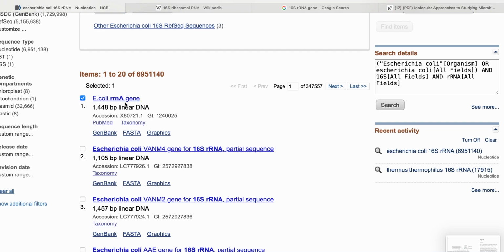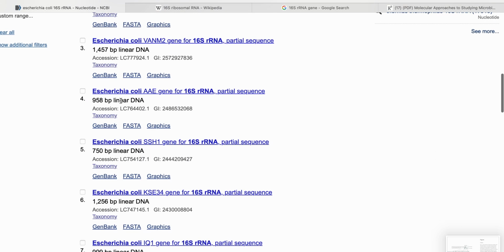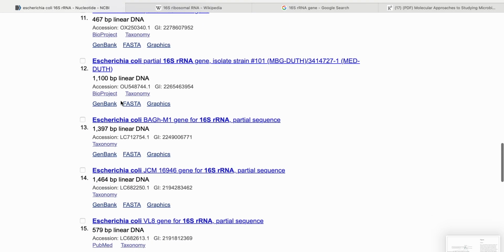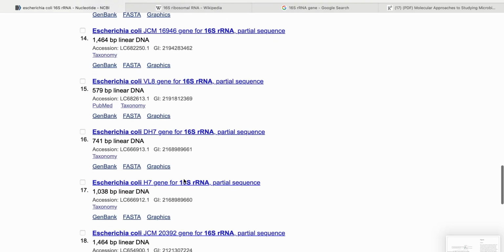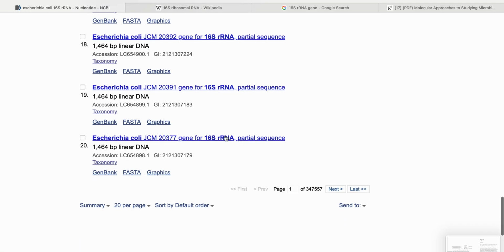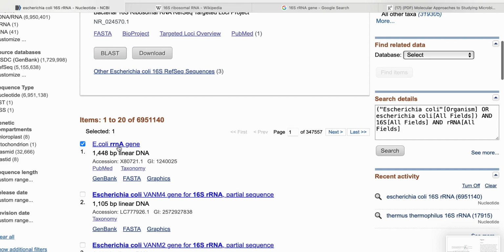And it's saying, although this doesn't, well, we don't know what that really means. Let's look for one which is completely obvious. There you go, this one's a partial sequence. Well, you can go through till you find exactly what you're looking for. But for now, I'll go with this one.